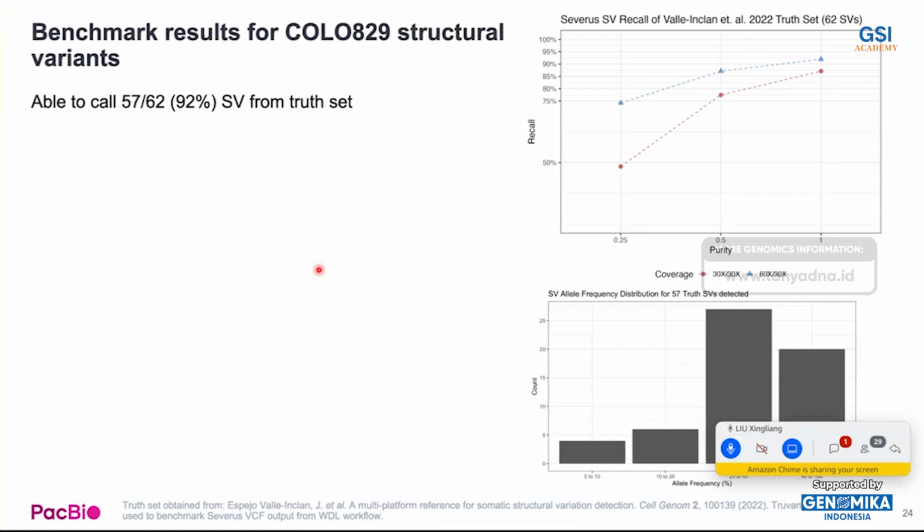So when we try those NGS tools for SV calling on our HiFi sequencing dataset, we might want to tune down the read number cutoff, because the NGS setting might be too stringent to detect the true variants using HiFi sequencing data.